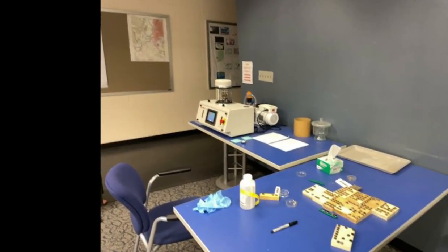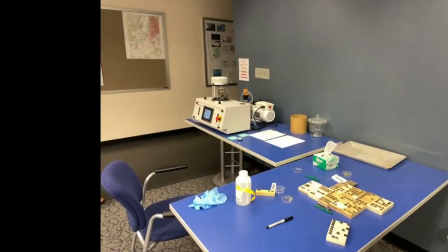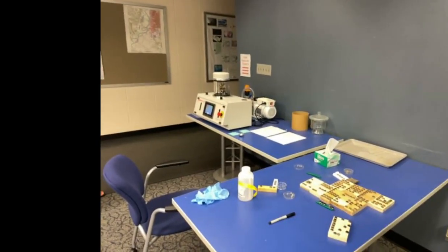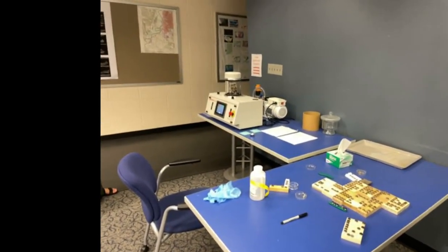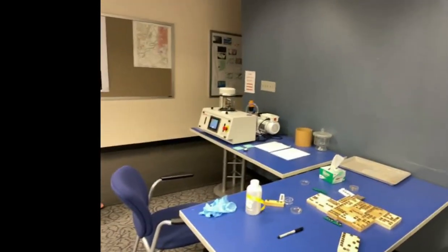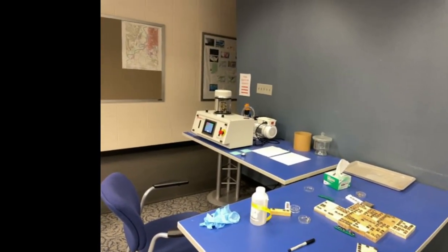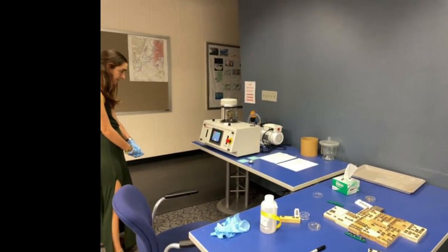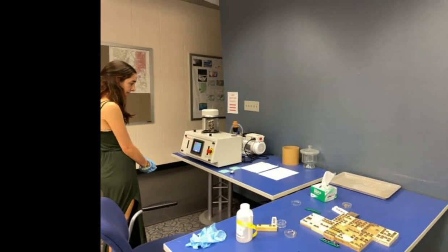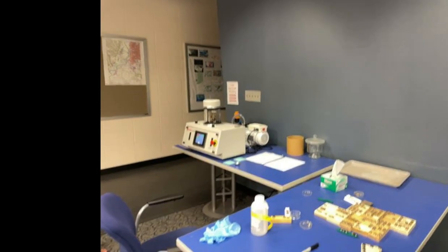That's the sputter coating process, so I'm trying to get away from it so I could talk on the microphone for a second because it can't quite hear us from across the room easily. All it's doing right now is pumping the air out of that little chamber. The bell jar at the top has to be in a vacuum in order for the plasma cloud to sputter coat the actual samples. You can see the samples are spinning around in there so that they will ultimately be evenly coated.